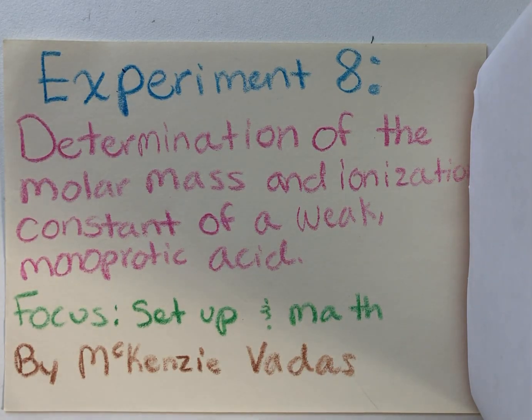Good morning. My name is Mackenzie Vedas, and for my lab experiment 8, determination of the molar mass and ionization constant of a weak monoprotic acid, I will be going through the setup and math.